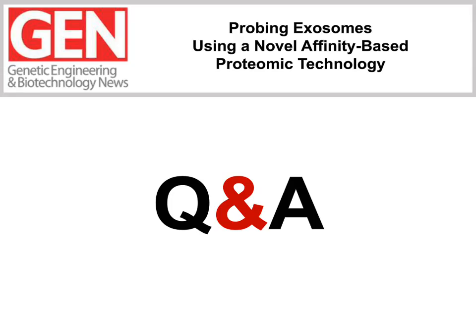Yeah, nothing much to add, although in general we think that phosphorylations are more likely to change the shape of the binding site than glycosylations, which are often elsewhere on the protein. But what I just said in relation to the SELEX process, making custom reagents, still applies.